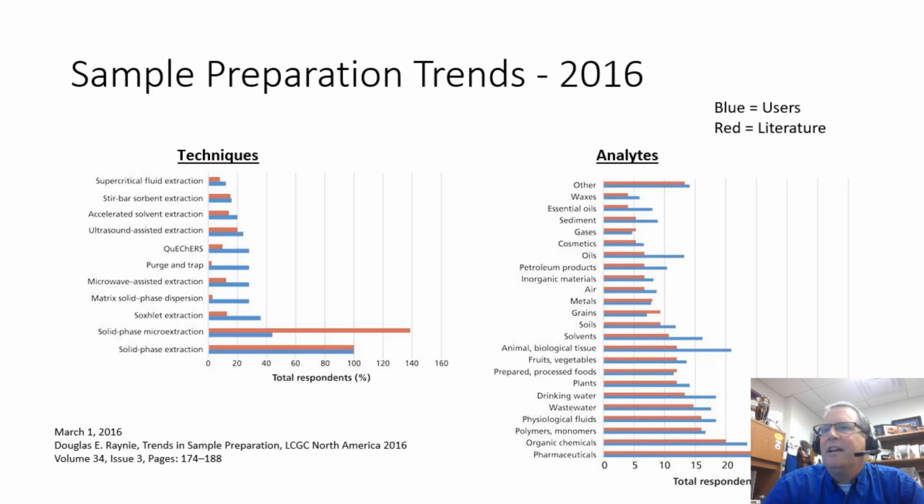And on the other hand, looking at microwave assisted extraction, not as much, but you see more users than you see literature. So what I see actually as an academic, I see that as an opening. I see that as an opportunity first to engage with users and find out what your real problems are, but then to think as an academic about how we can make it better. And I think that's very exciting about MAE, let's say in combination with GC, and some of these other techniques.